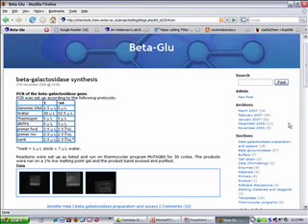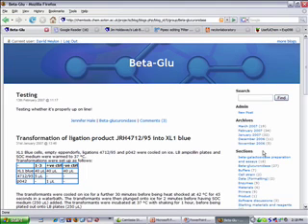So the student whose lab book this is was working on 2 different experiments in parallel. So she categorized those as beta-galactosidase and beta-glucuronidase, just two different enzymes that we were essentially doing the same things to. And here you've got immediately the first step beyond a piece of paper. I can now click on one of these and see all the stuff that relates to that particular project.